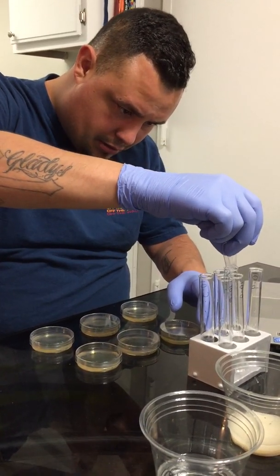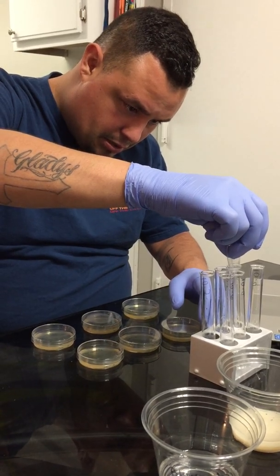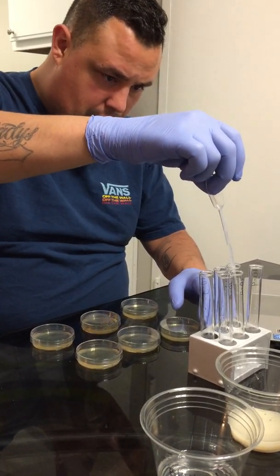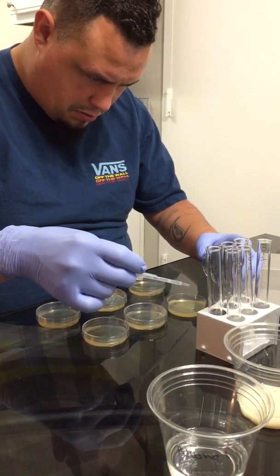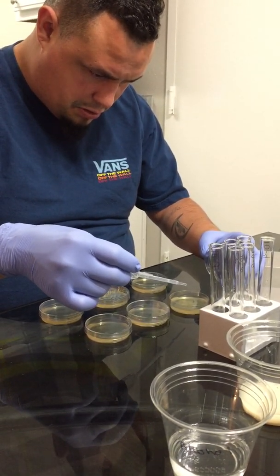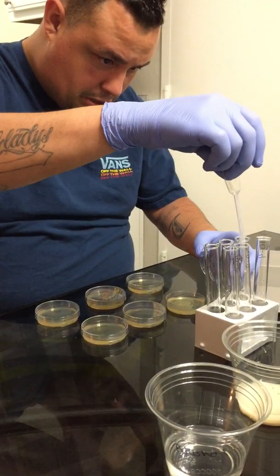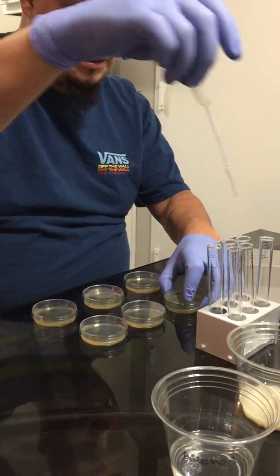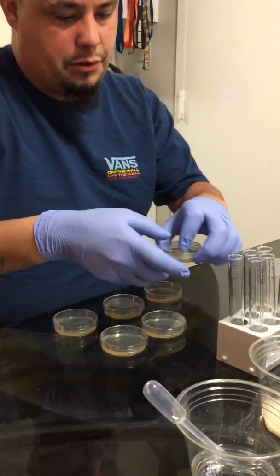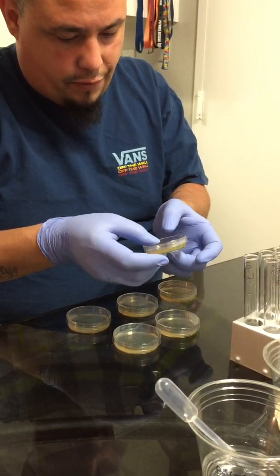Here we go. One, 2, 3, 4. Alright. We're going to move this so it gets evenly dispersed over the agar.